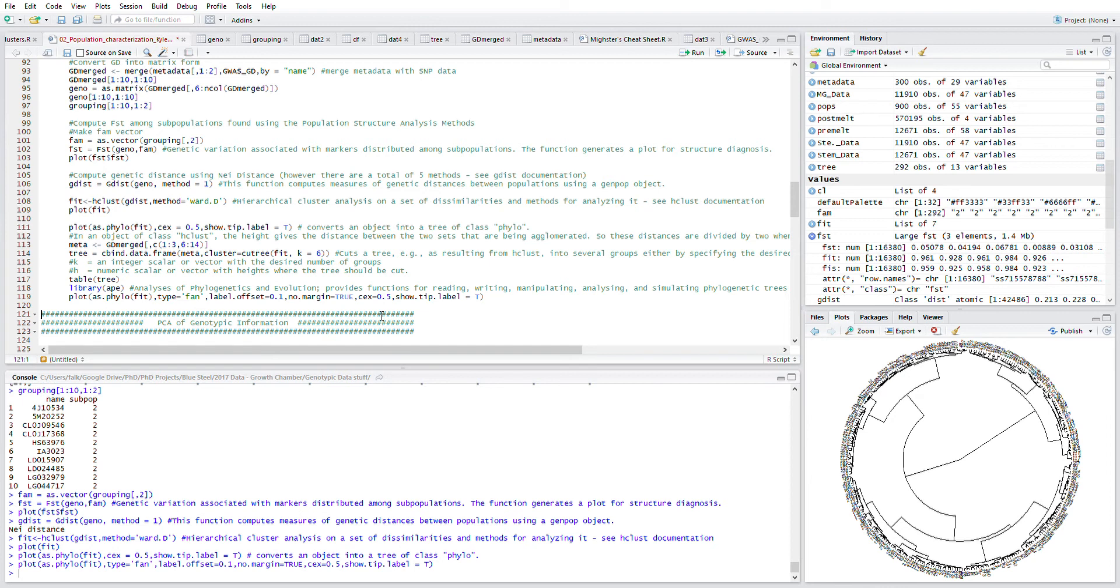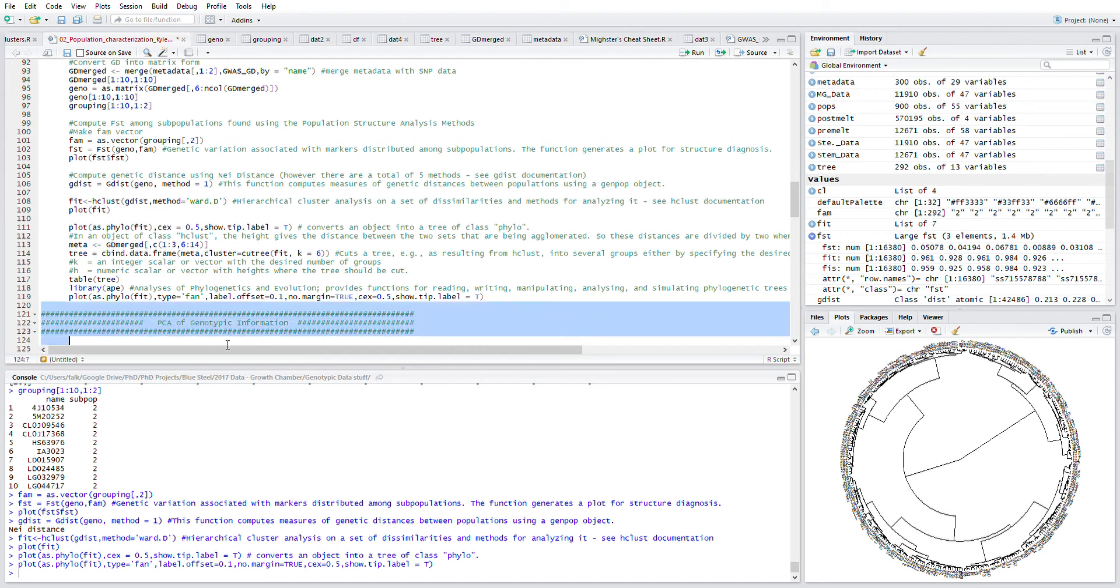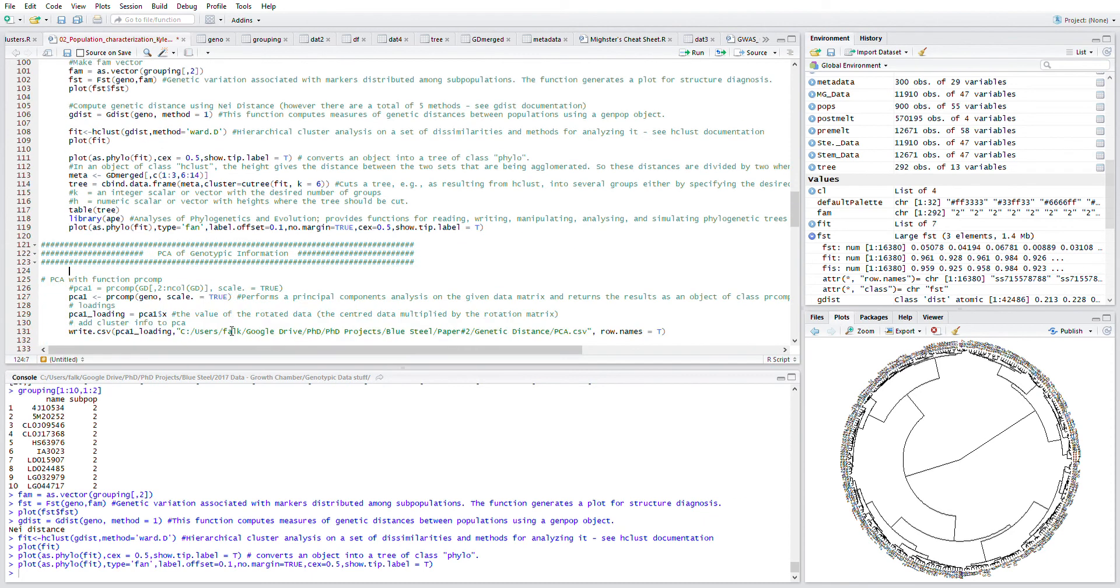What we'll do in the future is we can color those different genotypes based on the family or the cluster or subpopulation that they're in. That's all I have for this video. Next, we'll be looking at creating PCA plots using this genotypic information.